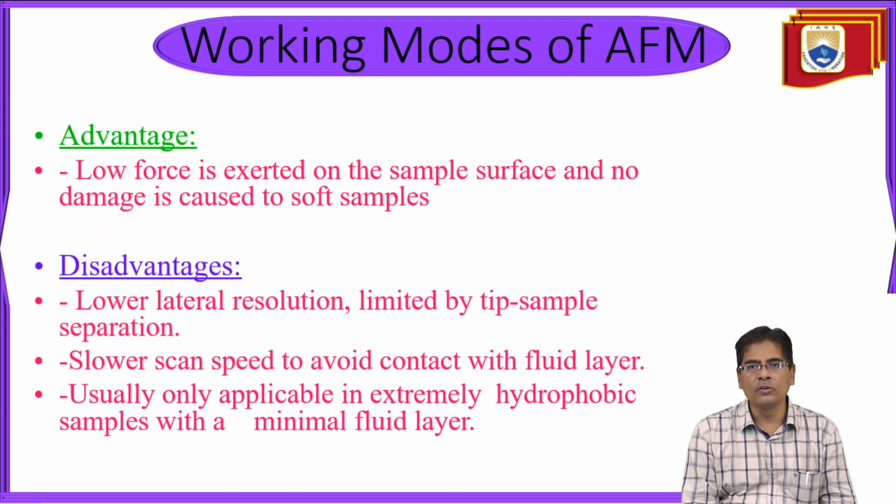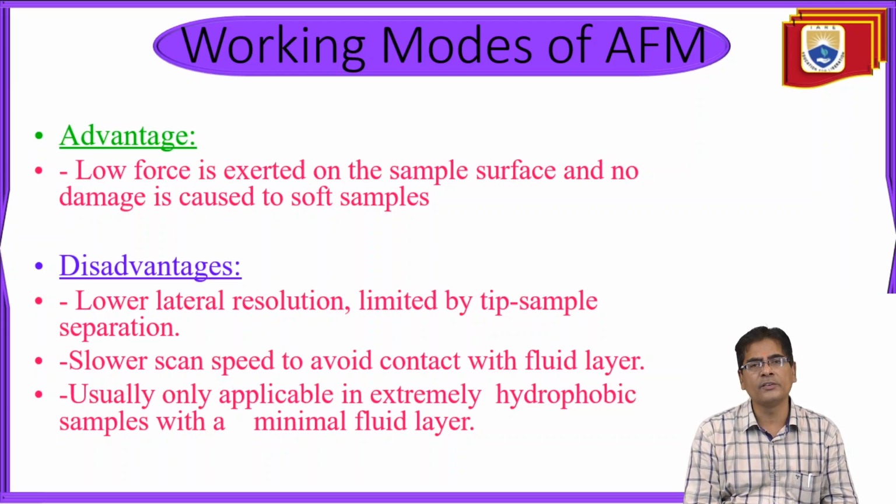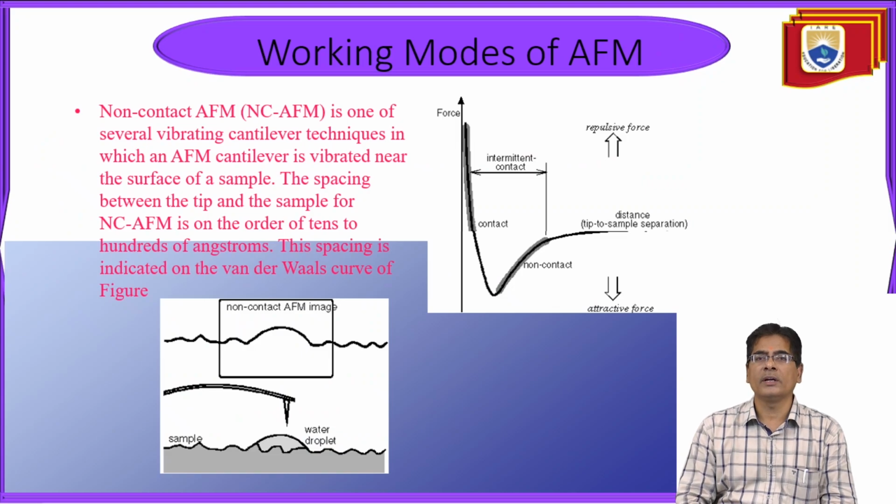So what are the working modes of AFM? That means the advantages and disadvantages of non-contact mode. Low force is exerted on the sample surface and no damage is caused to soft samples. Whereas in case of disadvantages: lower lateral resolution limited by tip-sample separation, slower scan speed to avoid contact with the fluid layer, usually only applicable to extremely hydrophobic samples with a minimal fluid layer.